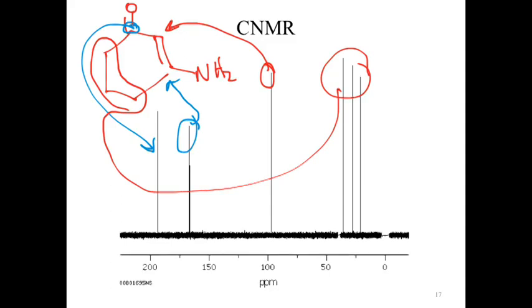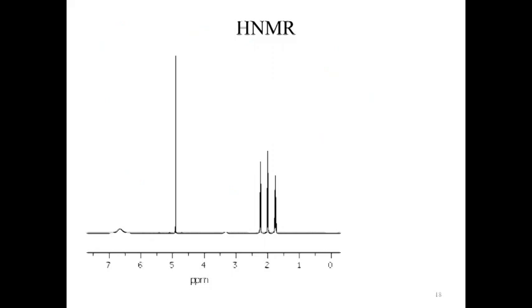And then we could go back through and look at the HNMR, but I'm pretty sure you're sick of looking at HNMR. What we're trying to do is convert all of that information out of those spectra and into some hopefully organized and interpretable fashion. Okay, I believe that is everything. So what we just went through and did in an hour was solve one spectra. Okay, and that's using someone that in theory knows it fairly well.